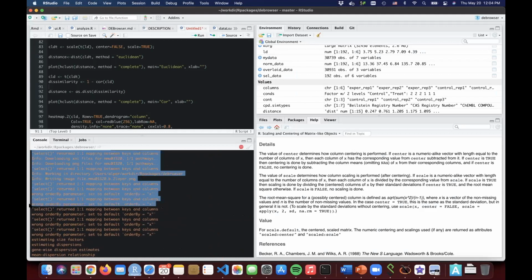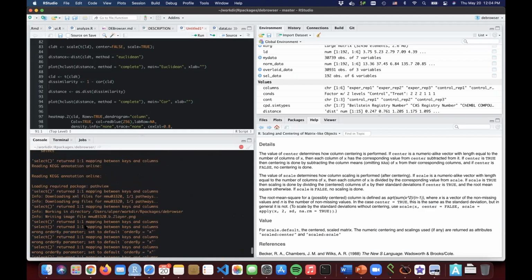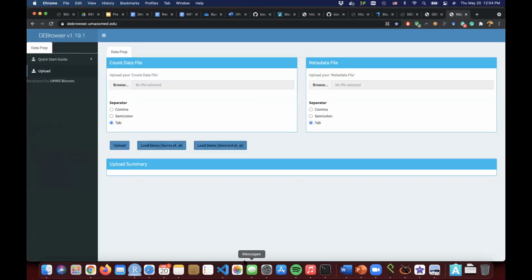There is order by X. It says something like this. Sometimes they change things in R that we don't know they changed, and they affect our packages too. We discover them from other users, and then we fix our side too. This is a very collaborative world, but sometimes it makes our job harder if you cannot communicate with the community well, or if they don't communicate their code changes to the community. This happens to us.